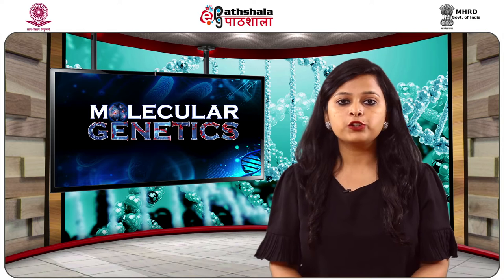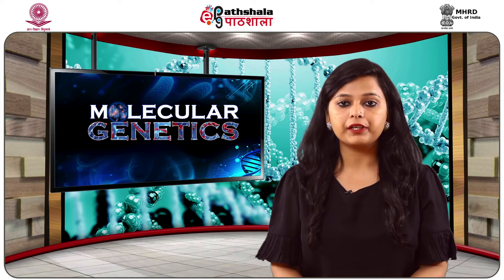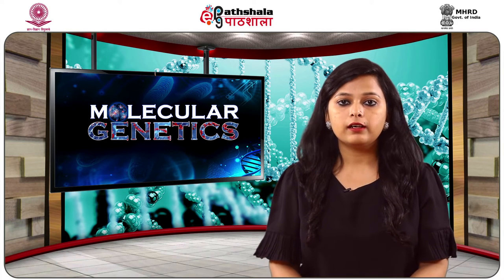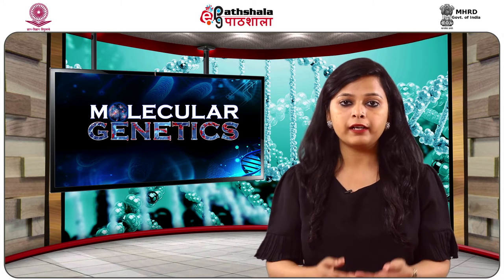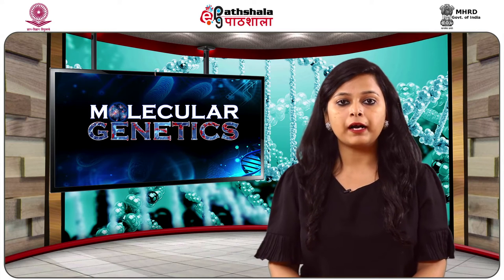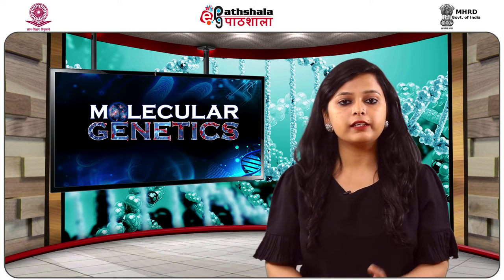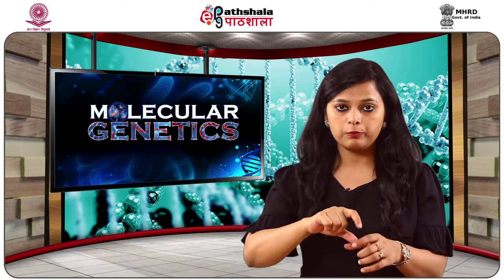In southern blotting, the genomic DNA is digested with restriction endonucleases, and the fragments produced are then separated by gel electrophoresis on the basis of fragment length. After staining the gel, the separated bands are visualized. Thereafter, the denatured DNA fragments are blotted onto a nylon membrane using capillary action or electrophoresis. Further, during hybridization, a probe, that is a fragment of nucleic acid carrying a specific sequence of the gene of interest, binds to the blotted DNA fragments carrying identical sequences. This hybridization between the DNA sample and the probe can be further visualized by means of the labeled probe.